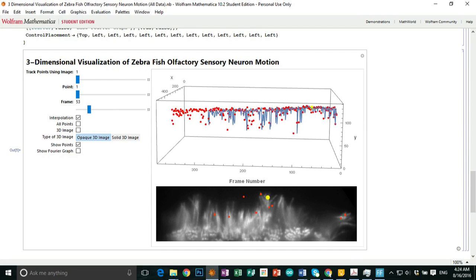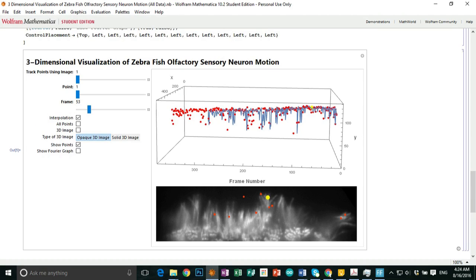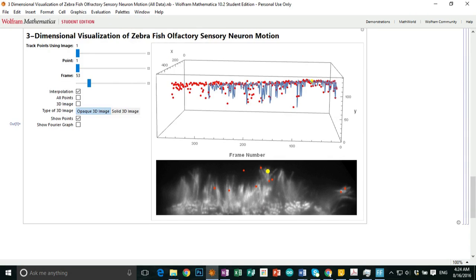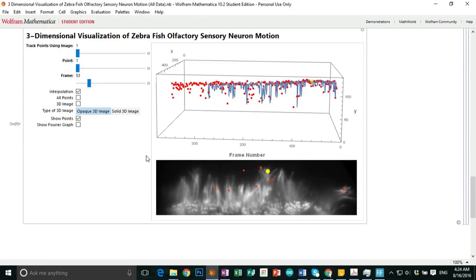And that is because ImageFeatureTrack, which is the command that I'm using to track all these neurons, the number of points that it actually finds depends on the first image one puts into ImageFeatureTrack. So basically this puts image 1 first inside ImageFeatureTrack and then the rest, so that the number of points is determined basically by this image.